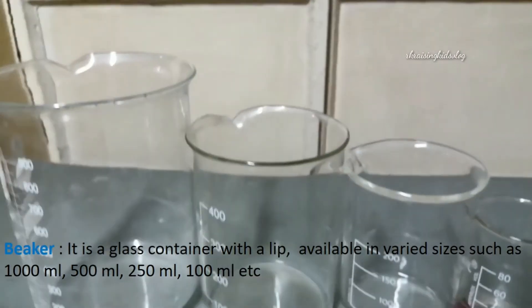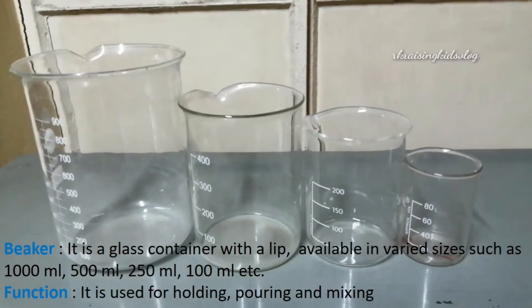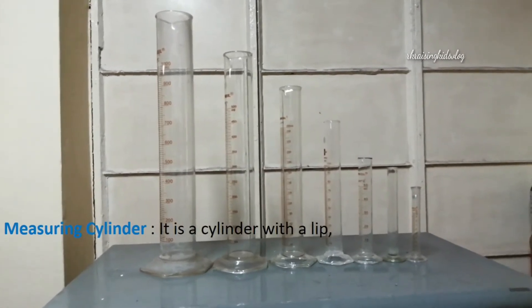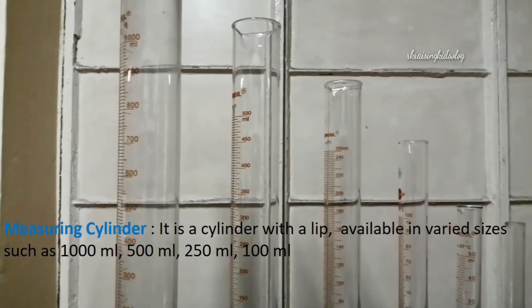The beaker is available in various sizes such as 1000 milliliters, 500 milliliters, 250 milliliters, 100 milliliters, etc. Here you can see the lip — this is a lip, and this is also a lip. The lip is used for pouring out solutions, and the beaker's function is that it is used for holding, pouring, or mixing solutions.